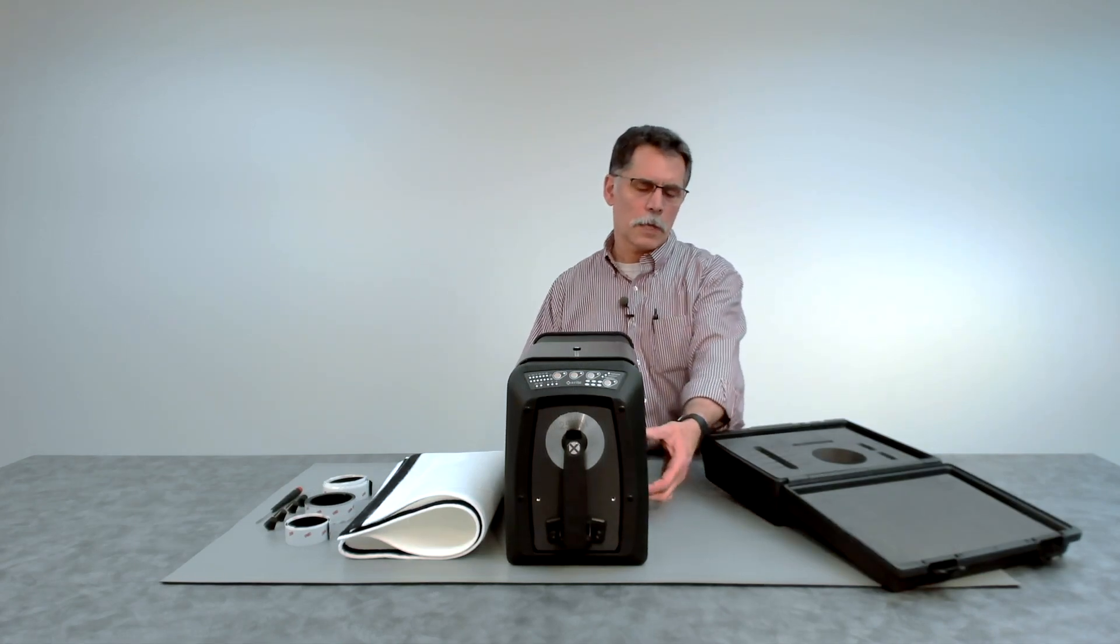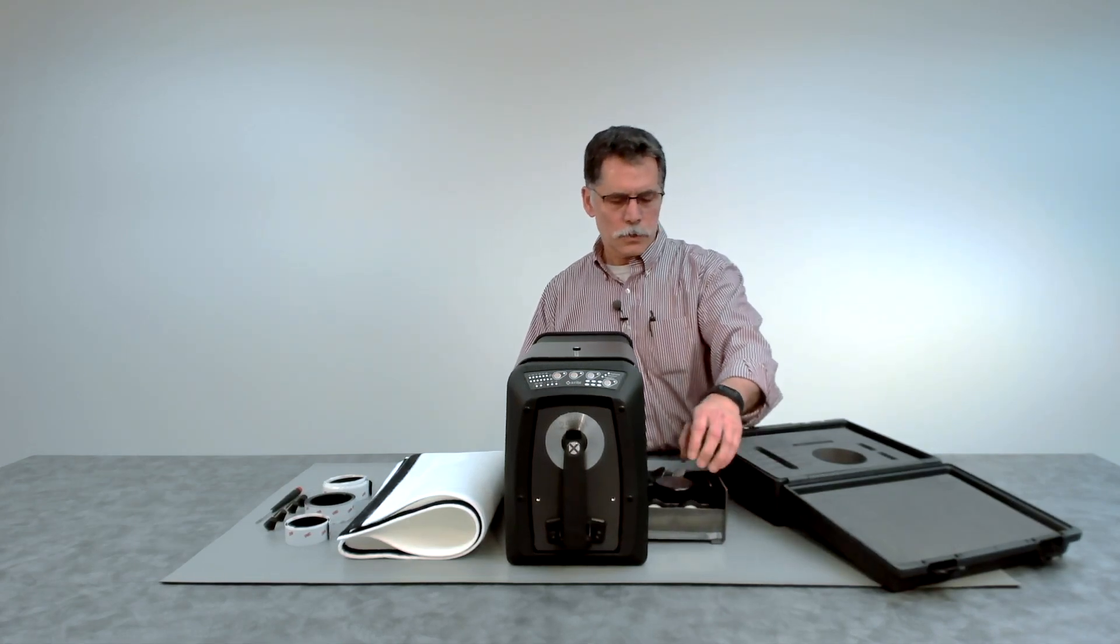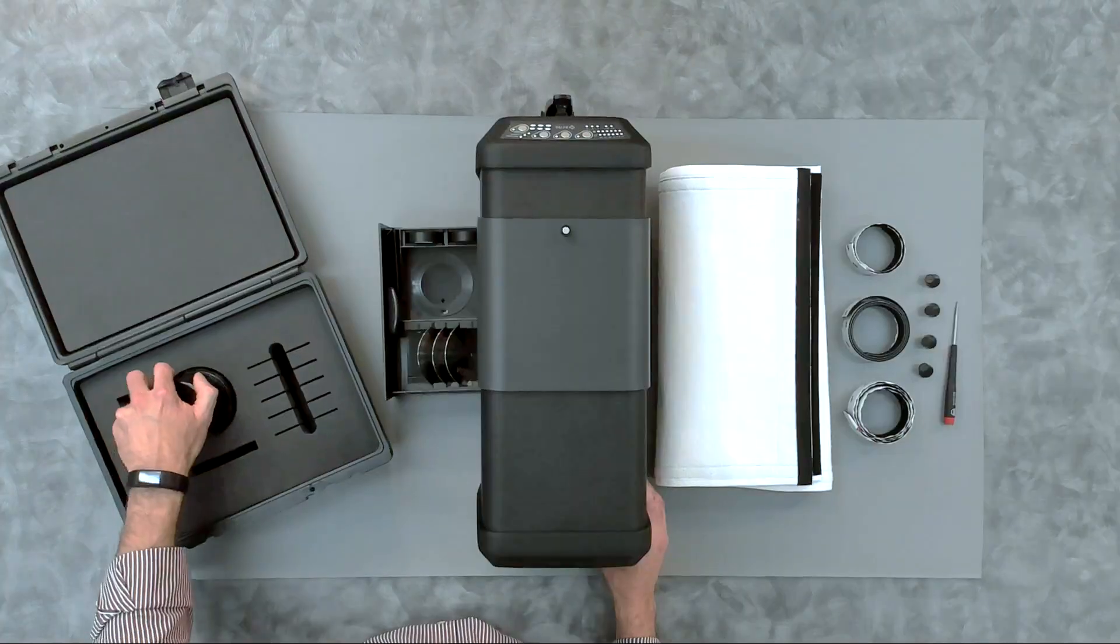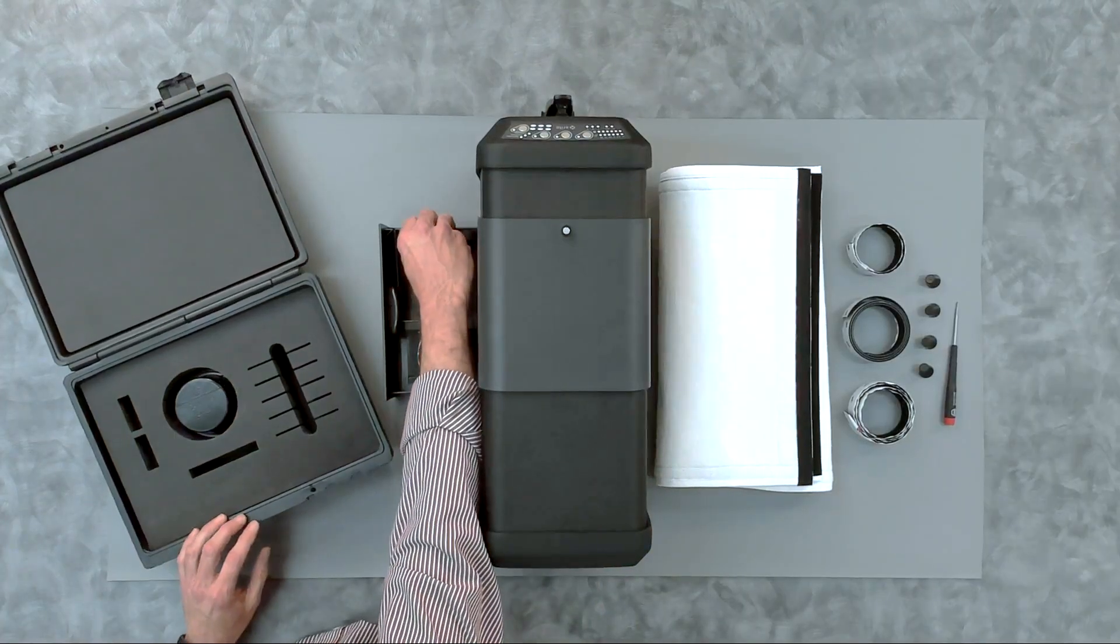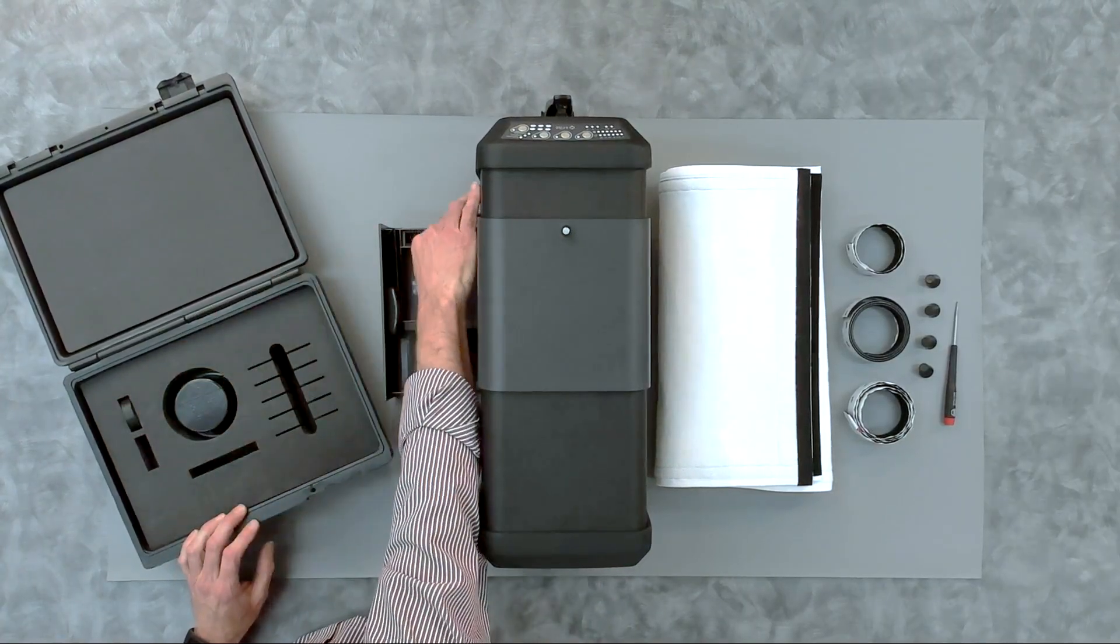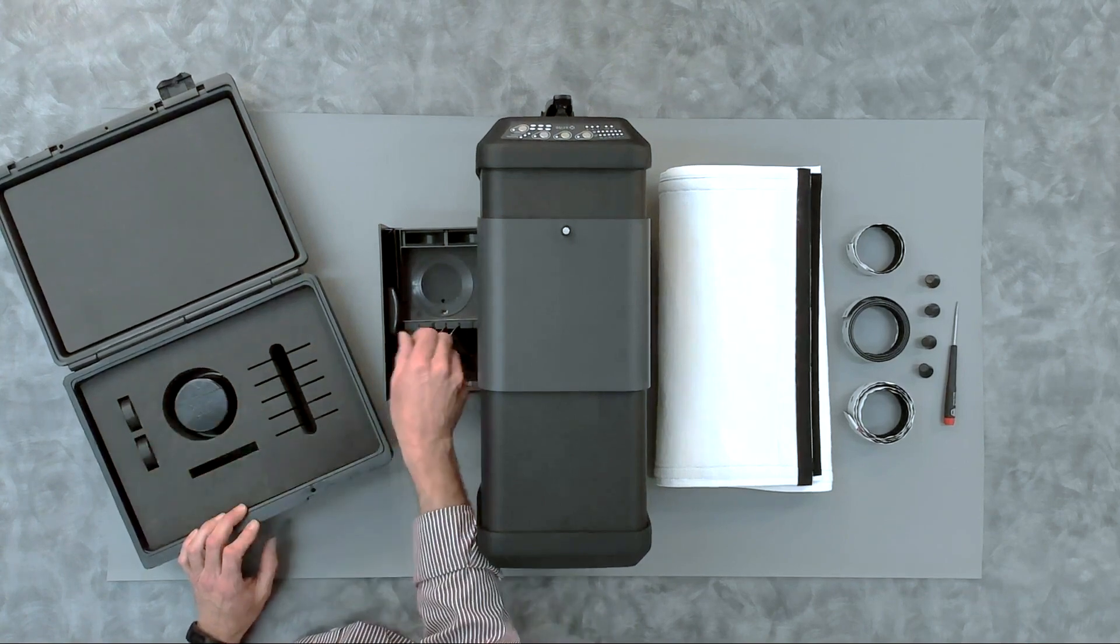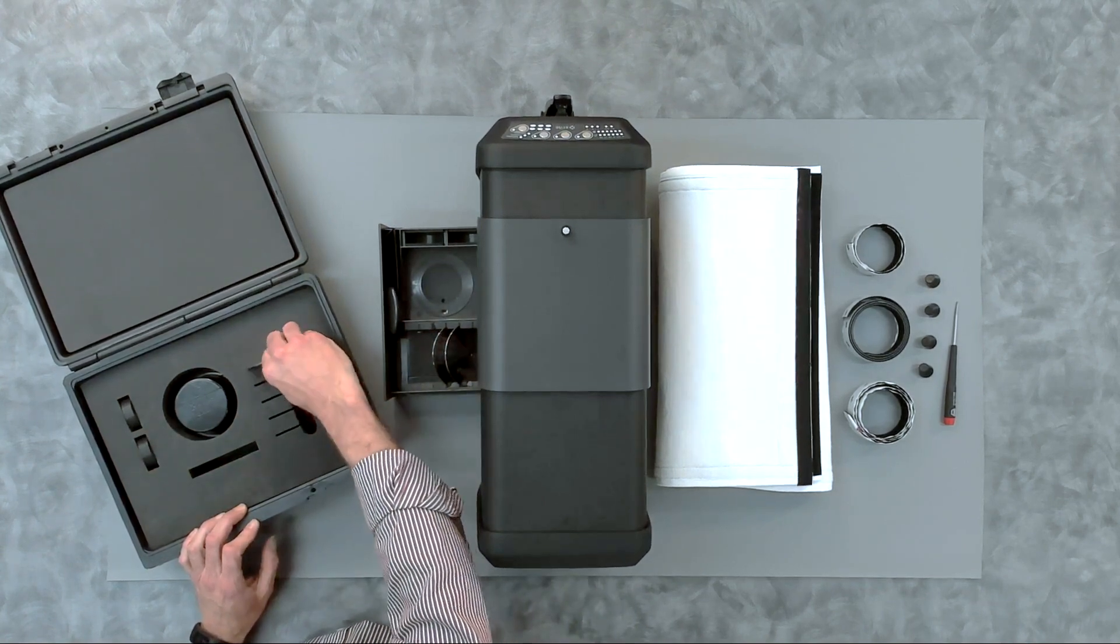The first step in installing the X-Rite Benchtop Filter Kit is to empty the accessory drawer. Calibration media and aperture plates are put into the separate case that's provided.